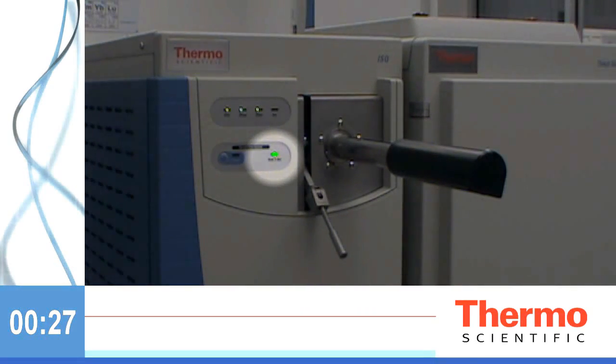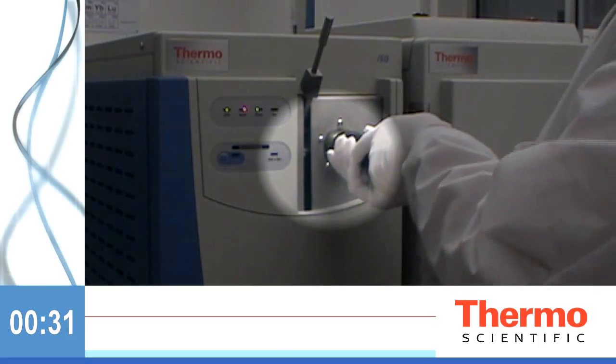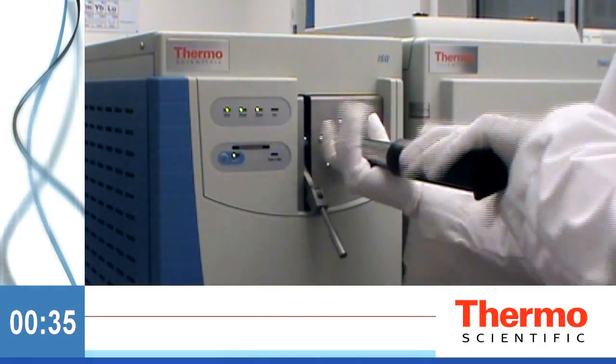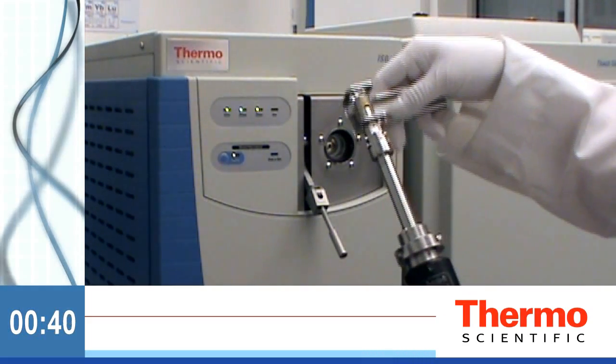When the ready-to-open light goes green, open the valve, insert the tool, connect to the ExtractaBrite cartridge, then retract it. You can't take the tool off while the valve is open.